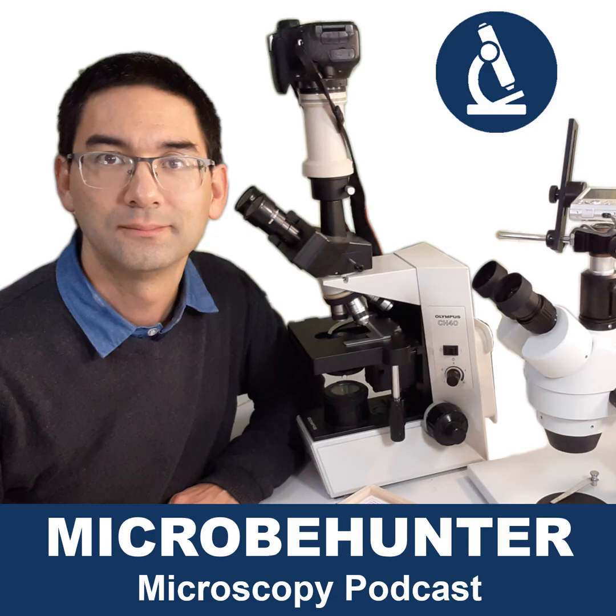There are also other stains that stain other parts of the organism, and depending on what you want to make visible, you choose a different stain. Now, the problem with that is that this actually kills off, in many cases, the organism that you want to look at. So especially if you want to look at water organisms and they're moving around, you have to be very careful because many of the stains actually kill the organism because, of course, they chemically react with certain parts of the cell.